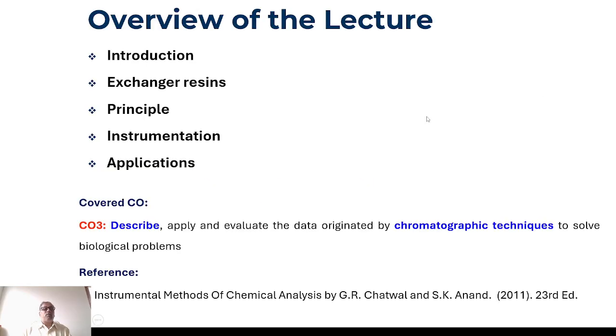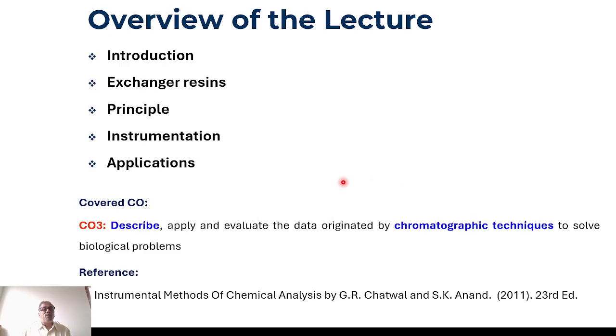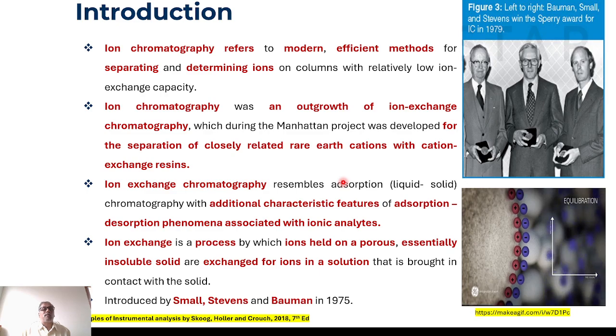So I'm going to introduce the chromatography, ion exchange chromatography. Then I will be discussing different types of stationary phase material, that is resins, then the principle of this chromatography, then how to proceed with this, and finally I'll end up with applications.